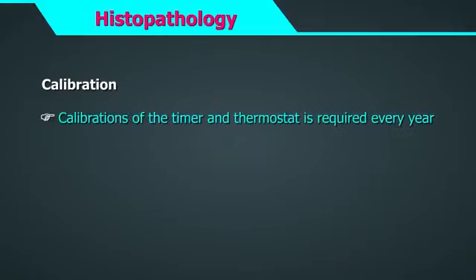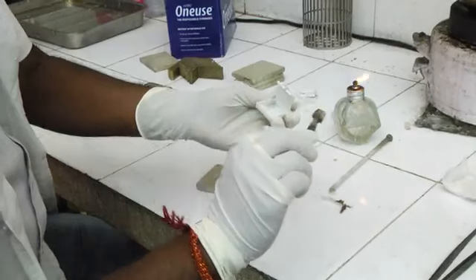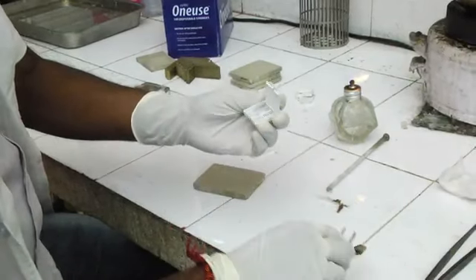Calibration. Calibrations of the timer and the thermostat are required every year or as per lab policies. Embedding. The impregnated tissue now has to undergo embedding.